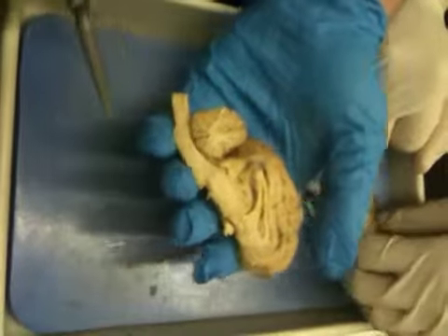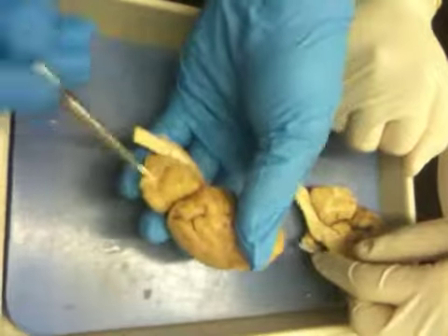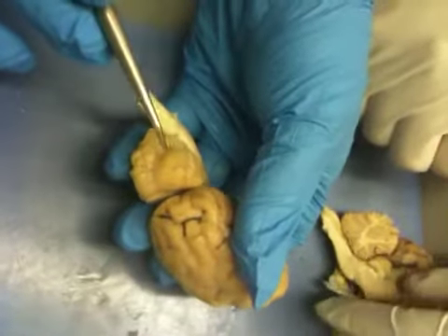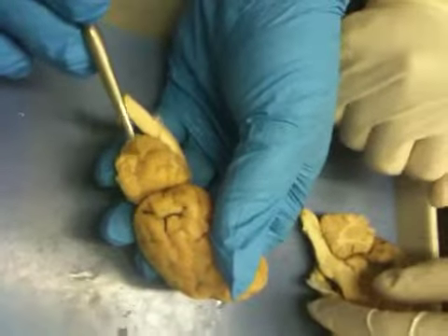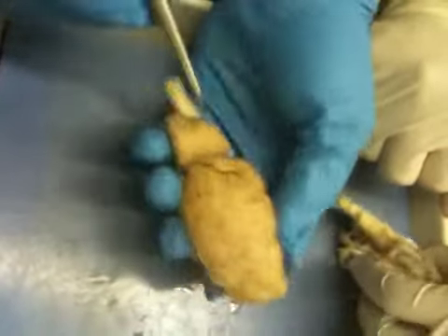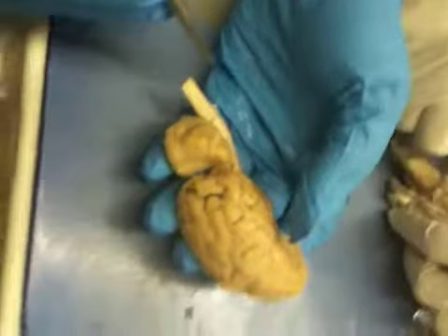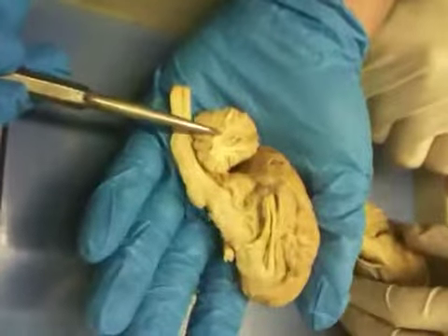The folium and the sulcus is equivalent to the sulcus and the gyrus of the cerebral cortex. You can see them out here. The sulcus is the little lines, the little ridges in it. You can't see them as well as in the cortex, but there they are. And instead of having gyrus, it has folium. And foliums, I believe, would be the folds. Then we go into the vermis, which is this thick piece of white matter in the cerebellum.